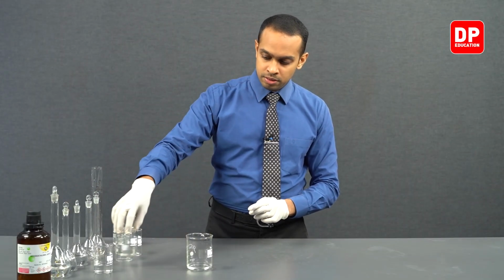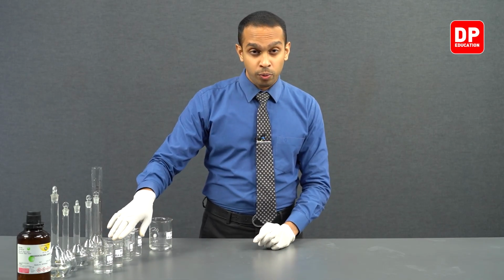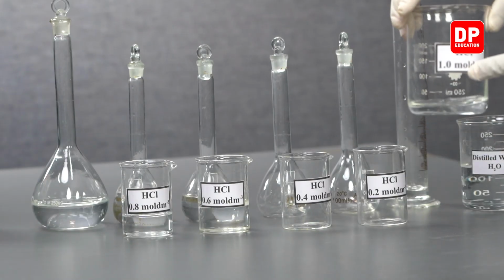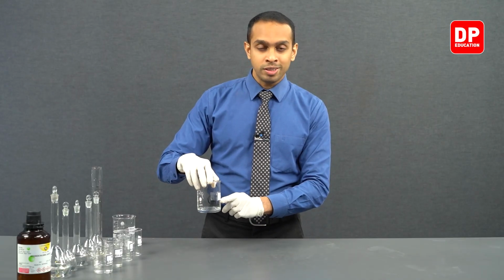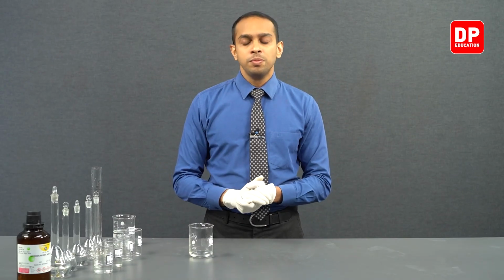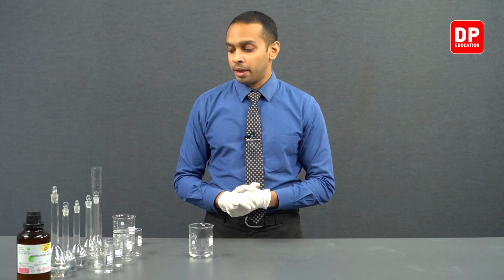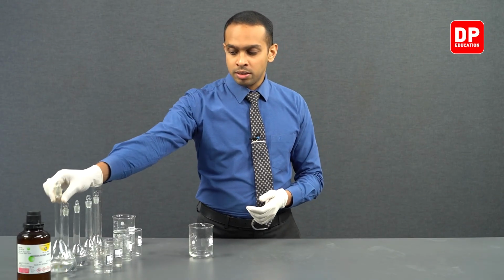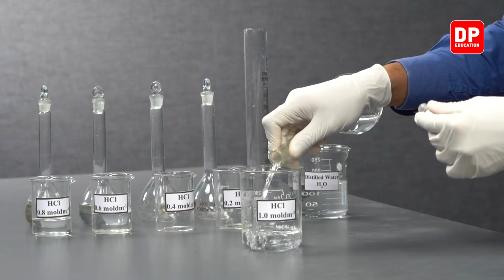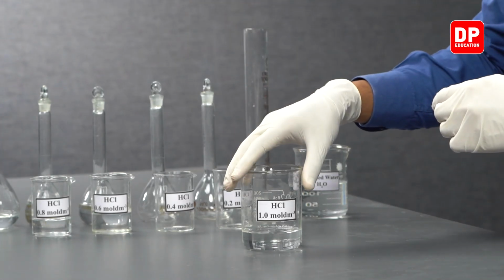Now we have prepared two solutions, 0.8 and 0.6 moles per decimeter cubed concentrated HCl solutions, with the use of 1.0 moles per decimeter cubed HCl. Now we are going to be preparing 0.4 moles per decimeter cubed concentrated HCl. Again, in order to do that, we would need more 1.0 moles per decimeter cubed concentrated HCl. So we have taken a small amount of that into this beaker.